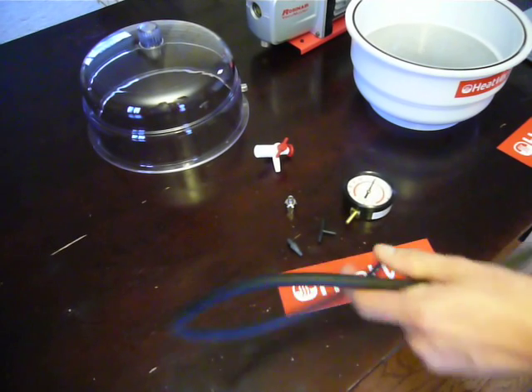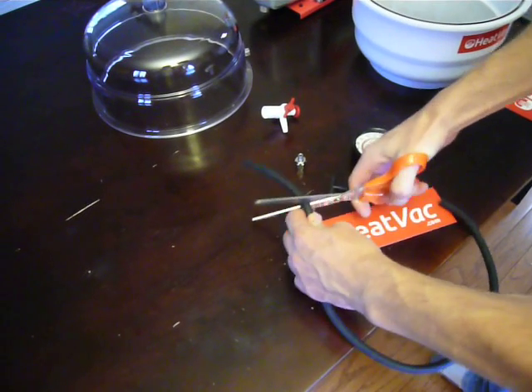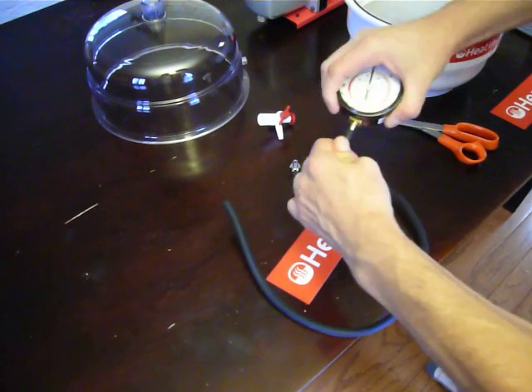The first thing I like to do is take one end of the hose kit and cut off a short section, 3 to 4 inches. This is going to be used to connect to the gauge, like so.